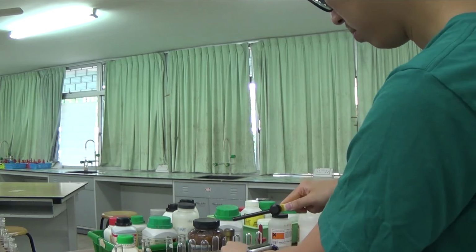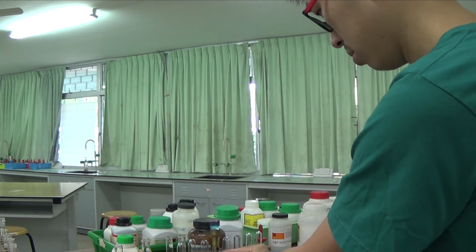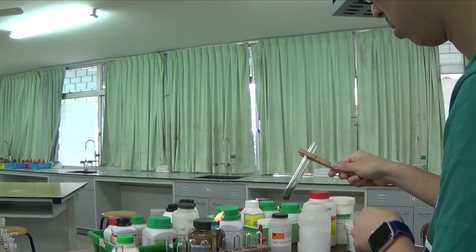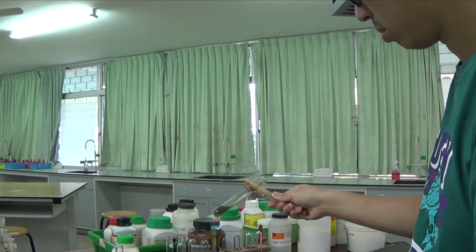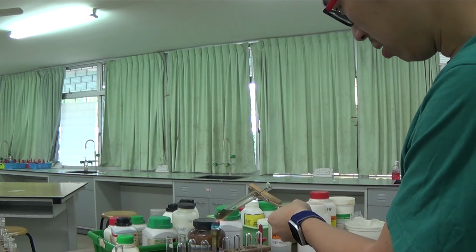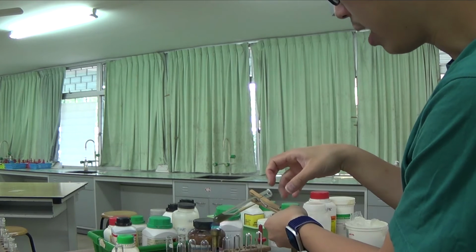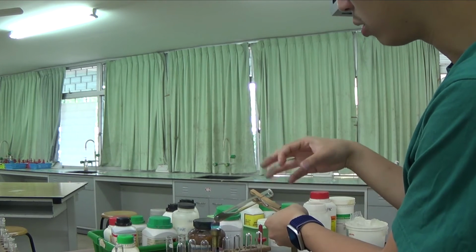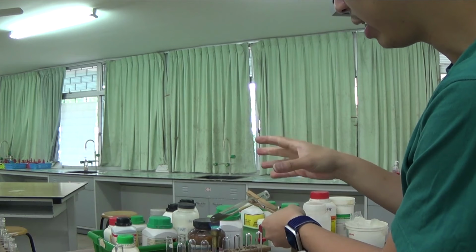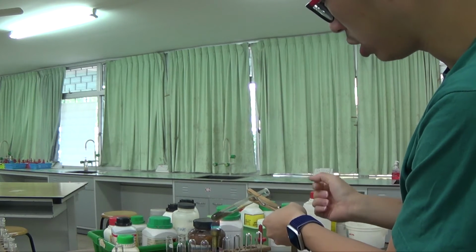And we are ready. So something that contains ammonium ions, and then in the presence of sodium hydroxide, when I heat it, I will get a pungent gas, P-U-N-G-E-N-T.